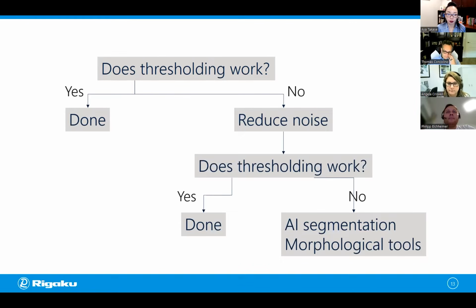Okay. So this is also related to segmentation. Let me launch it first. Okay. So here's the second question. Which morphological operation would be optimal to improve these segmentation results? And you have 5 choices: kill borders, opening, dilation, watershed transform, and erosion.